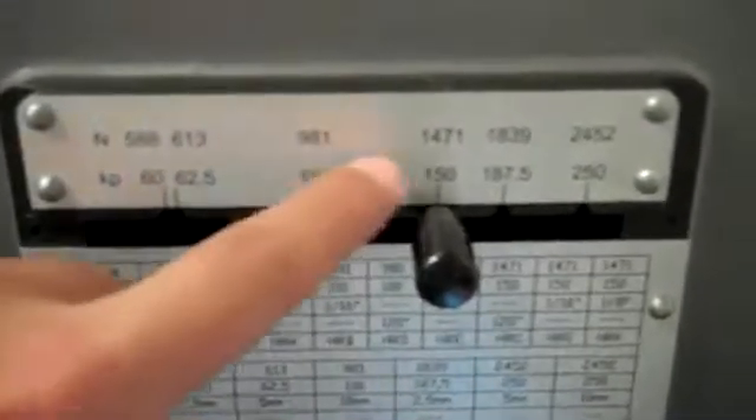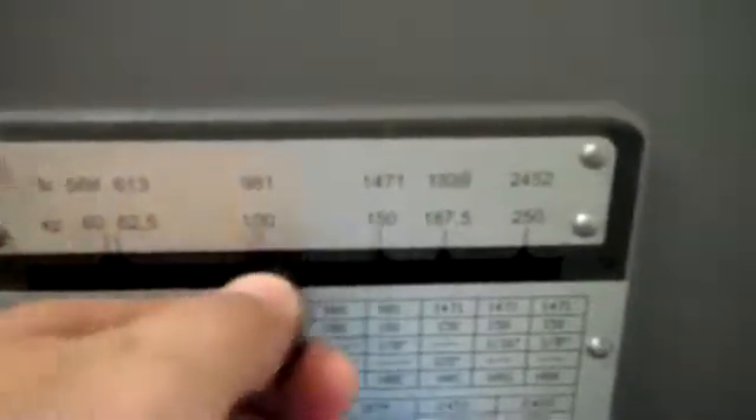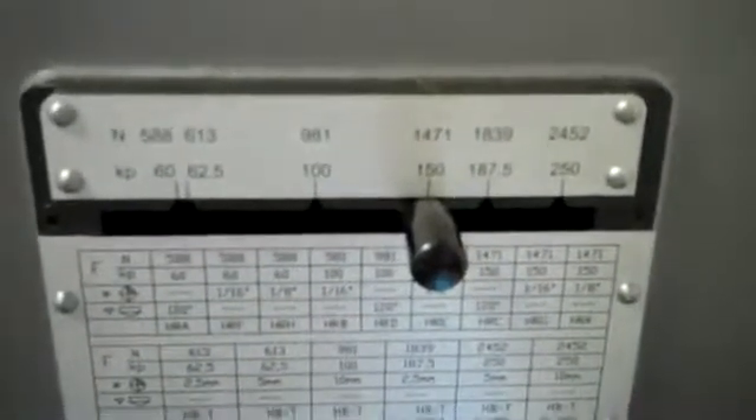On the side of the machine we have a very simple load selection. Right now we're in 150 kilograms, and it's very simple to select different scales with a quick dial-in weight.